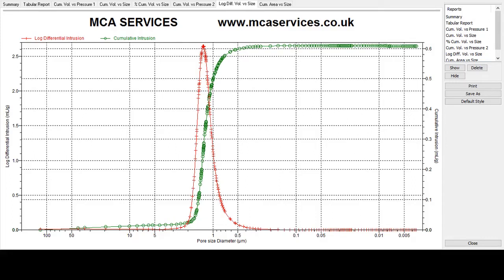Hello and welcome to the third video by MCA Services all about mercury porosimetry. In the last video we showed you how we select a penetrometer and how we load the sample into it. In this video we'll be showing how the sample is analyzed using our Micromeritics AutoPore 5 instrument.